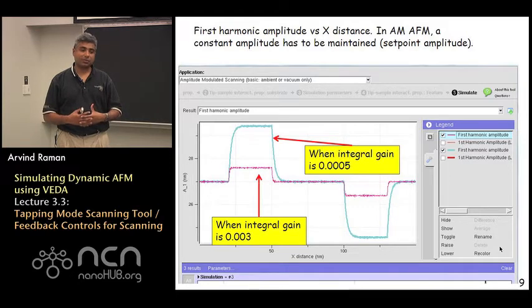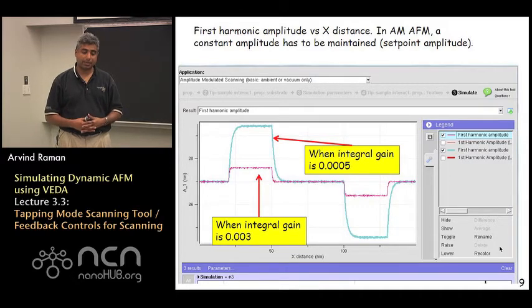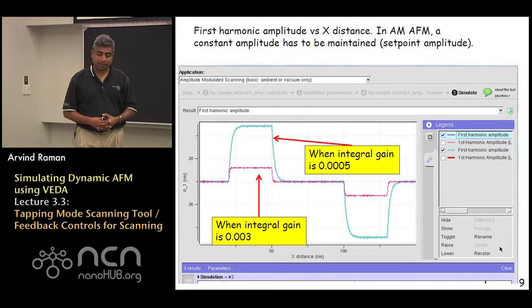The controller is trying to move to keep the amplitude constant. So this is plotted as the error signal, error map in tapping mode AFM.